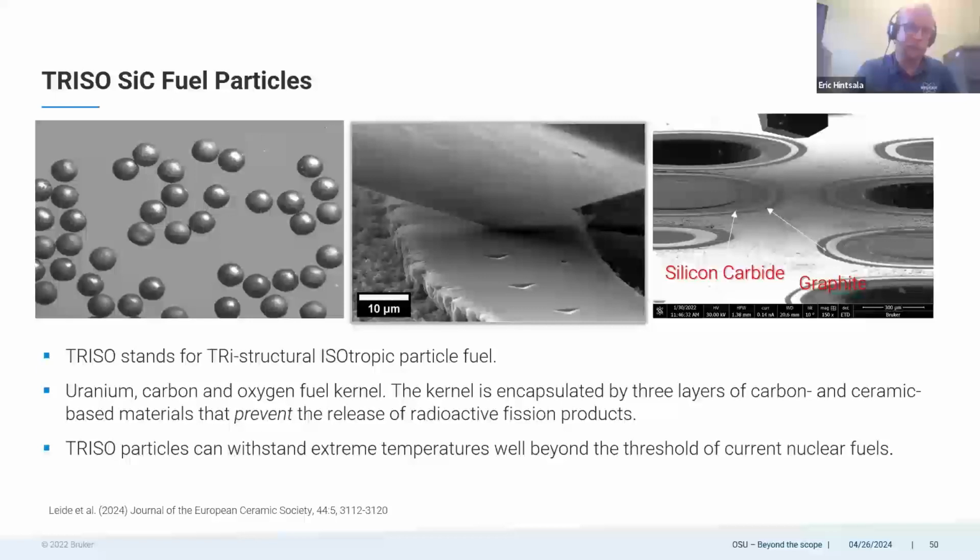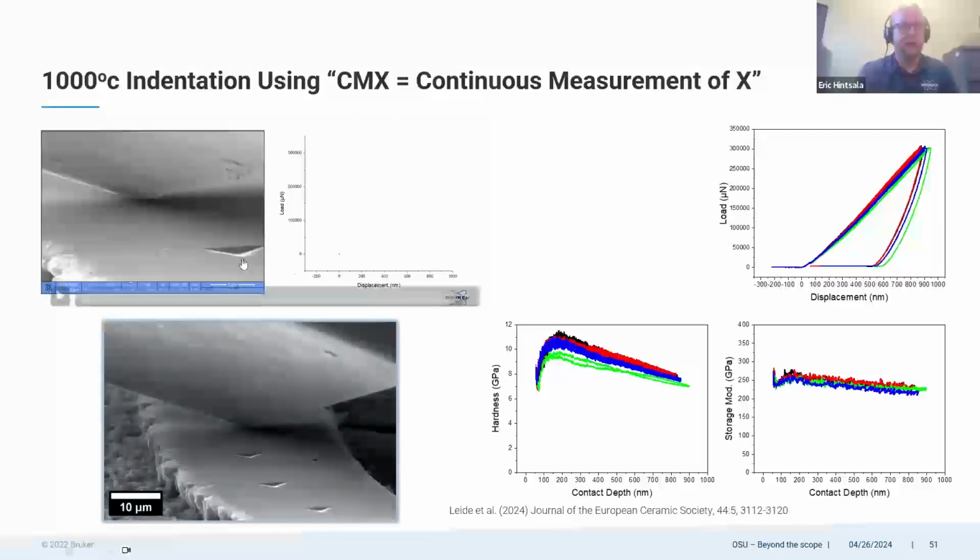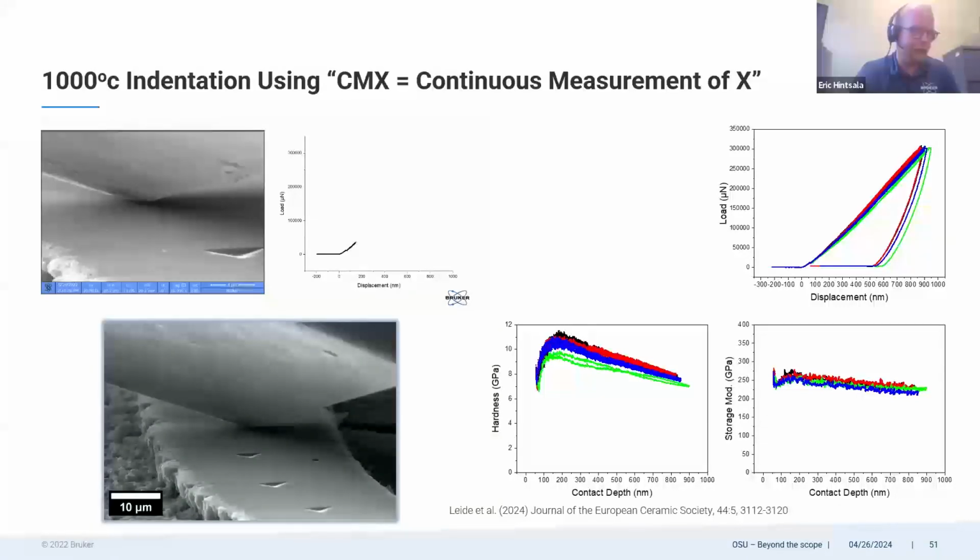We're testing surrogate fuel particles, obviously, but what we're looking at is the outer protective layers up at high temperatures to see how well they provide mechanical protection up to 1000 degrees C. And so the intent was to actually test the graphite phase as well, but what you can see in the image on the bottom left is that there's a big step height that's grown between the silicon carbide phase and the graphite phase next to it. And that's because at 1000 C, the graphite actually started oxidizing even in the SEM with a really good protective environment going on. So we ended up just indenting in the silicon carbide phase.